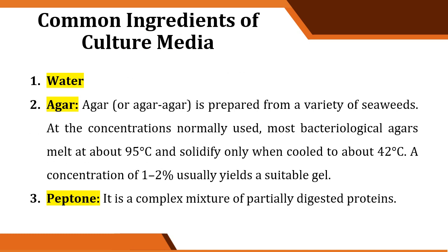So, what are the common ingredients na makikita natin sa mga culture media? So, among this list, hindi lahat ng culture medium meron sa kanila. Okay? Yung may mga specific lang. Okay, let's go on. Number one, first water. Okay, for water, di ba yung mga nabibili natin culture medium prepared is in powder form. Okay, so ang nilalagyan na lang natin siya or niluluto sa tubig, parang gelatin.